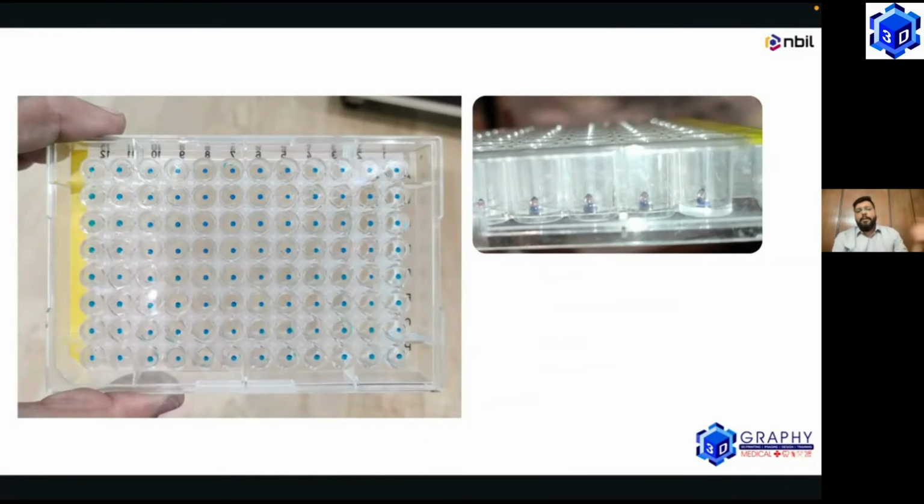Now, it's easy to call one extruder head to a point and print, but getting another extruder head to the exact same point and printing a drop right on top of the other required a lot of changes in order to ensure that the backlash that we were getting, generally when you're working with engineering systems, you're working with a certain error rate. And we had to bring down that error rate to a very, very big extent.